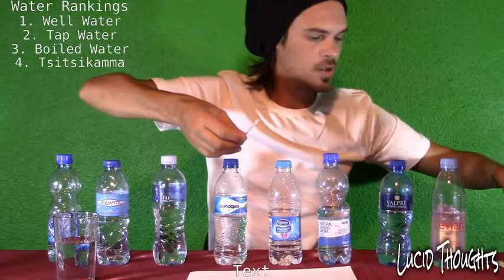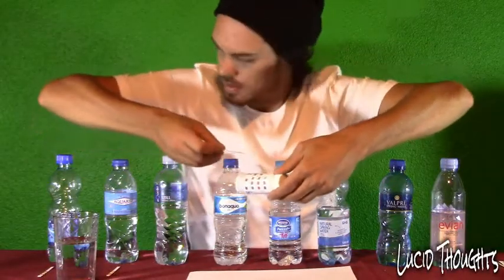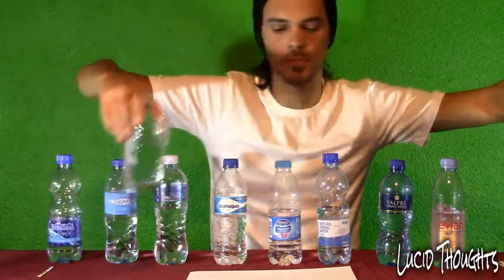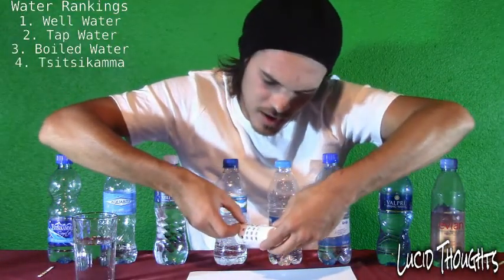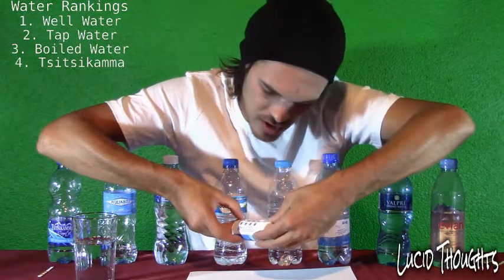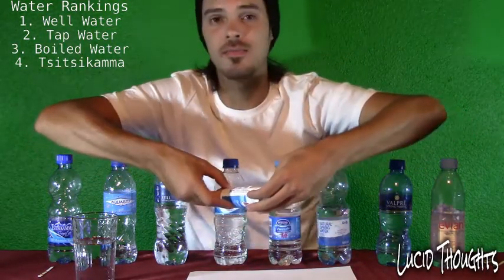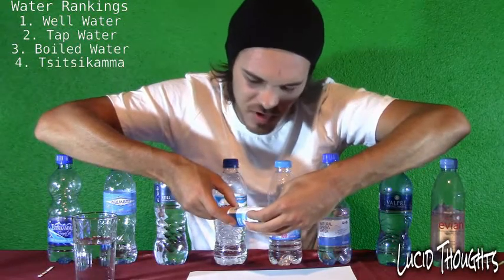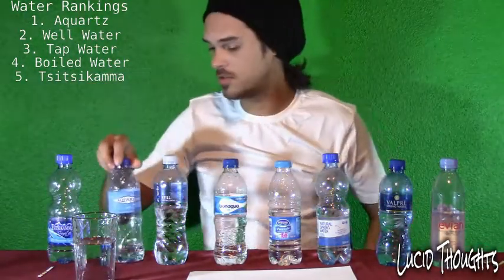Next up: Aquartz. I almost forgot to refill the glass. Let's try this again. The chlorine is nothing — 0.1, very good. The pH level is much higher — about 8.1. And the alkaline level is high — about 220 to 230. Brilliant! That's very, very good. Aquartz is a good water to have.